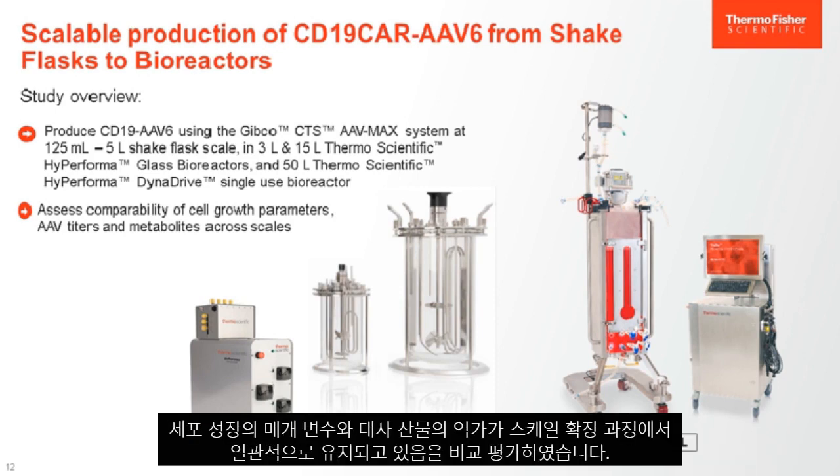And in the next slides, you'll see that we've assessed comparability of the cell growth parameters, titers, and metabolites across all of these scales, showing excellent consistency from shake flask to the 50-liter scale.